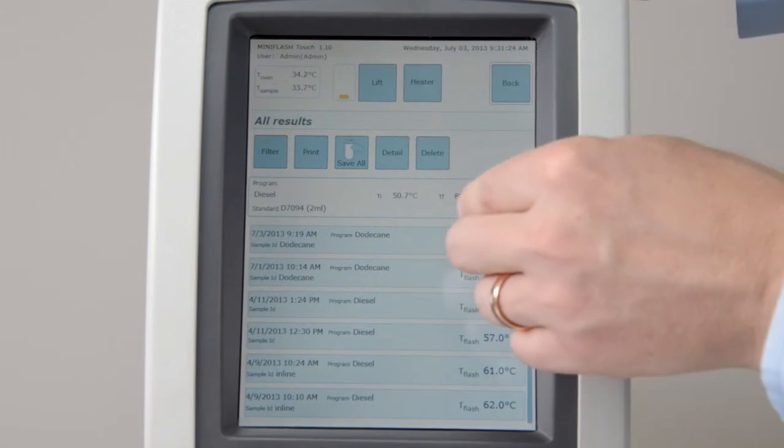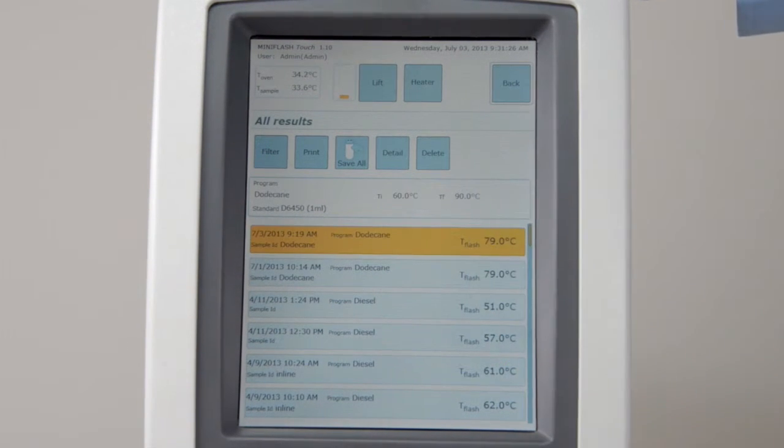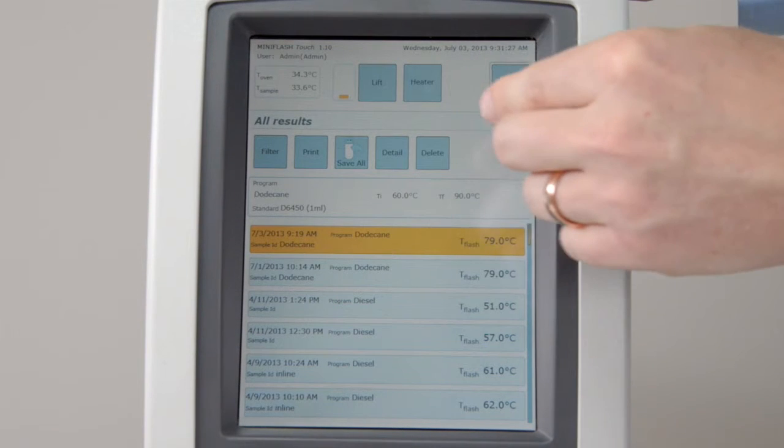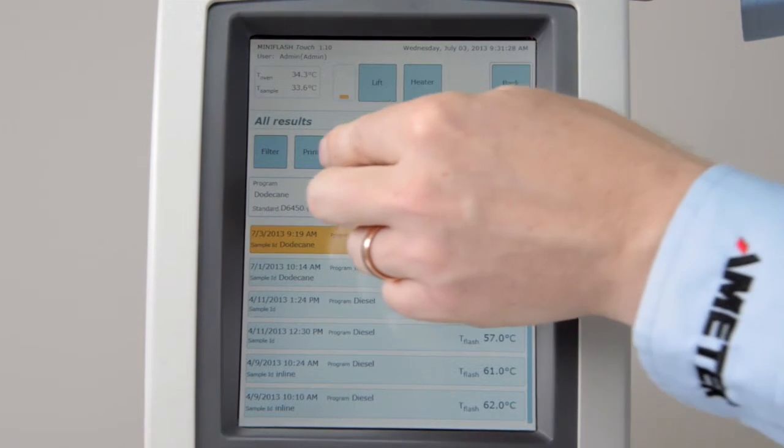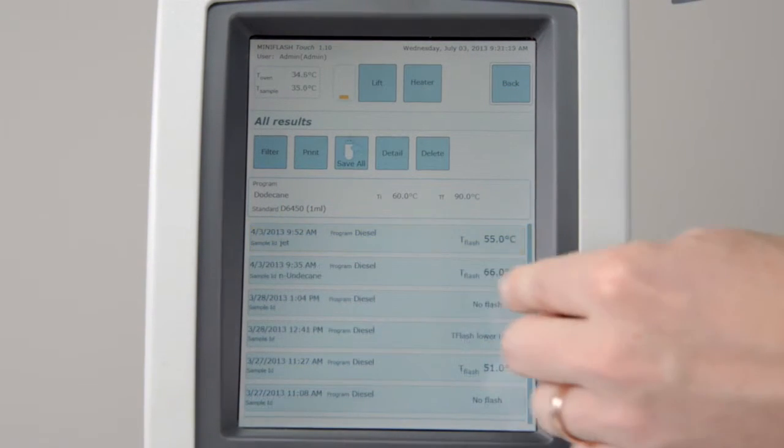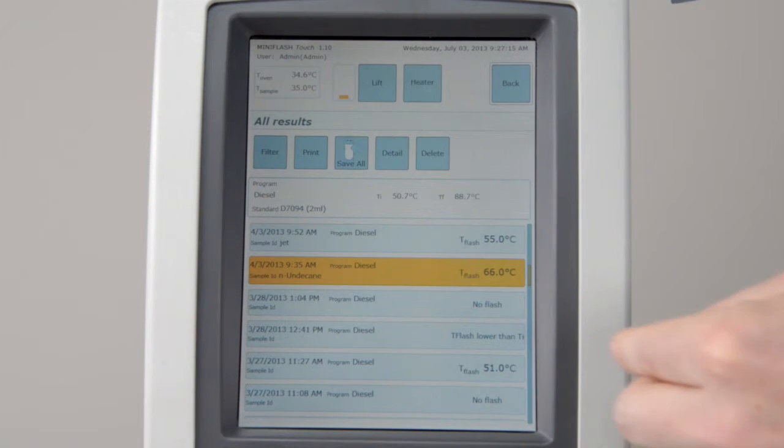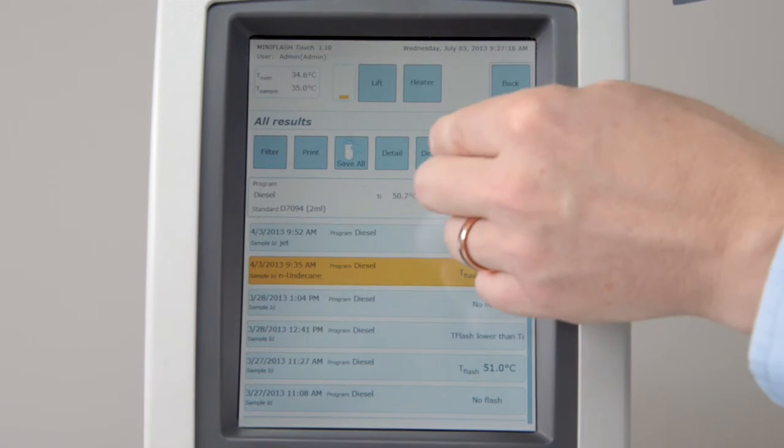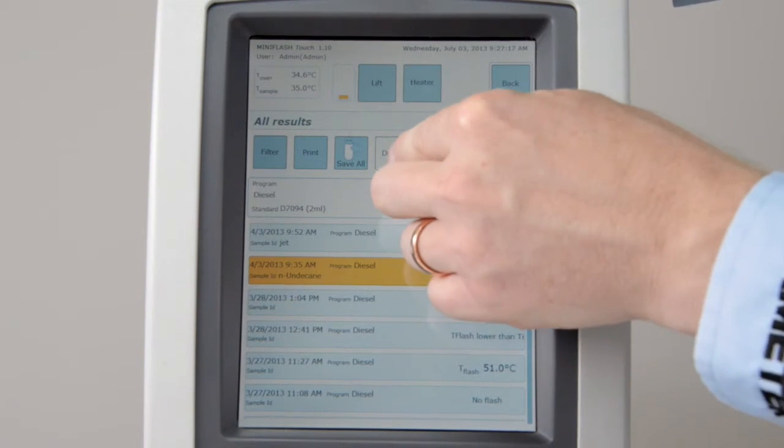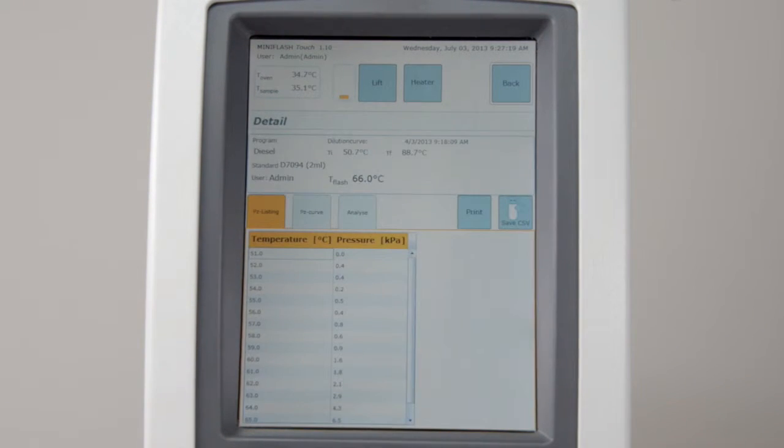In the results screen, you can choose to print or to save results to your USB device. To check a specific result, select the result. Click on Detail to access pressure listings.